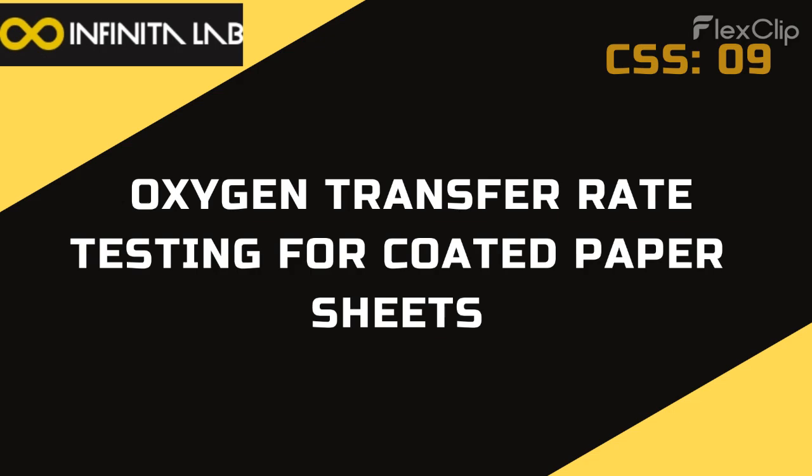Oh, absolutely it does. Think about it like this. Those little water molecules in the air, they can actually help oxygen molecules slip through a material more easily. Oh, interesting. So to really understand how well this paper blocked oxygen when it was completely dry, they had to get rid of any humidity. That makes a lot of sense. So they weren't just messing around with this OTR test. They had to be super precise.